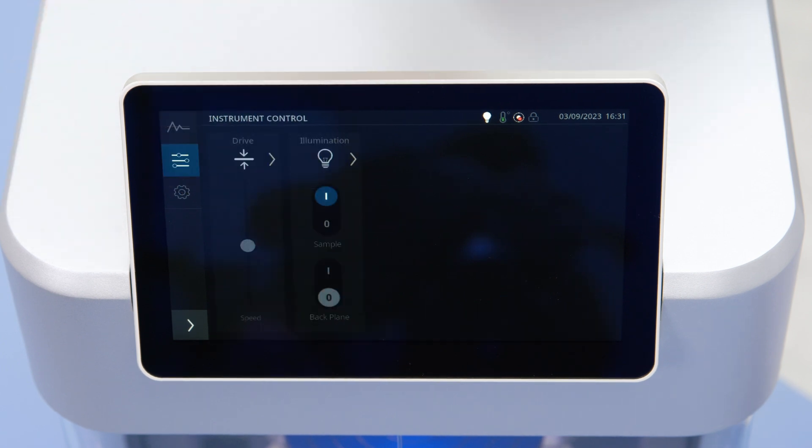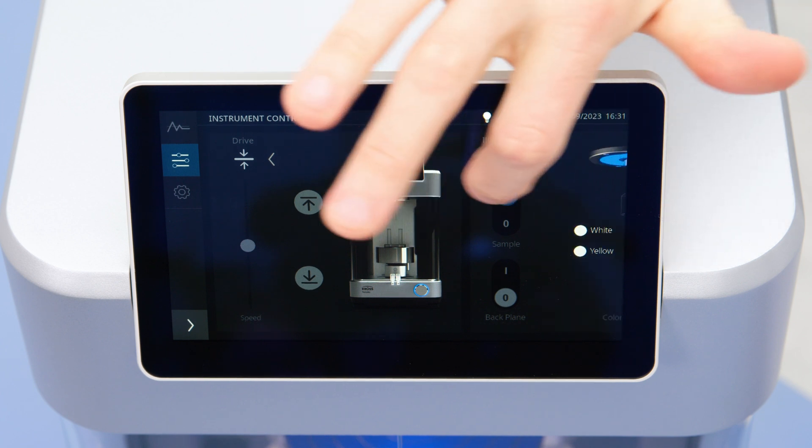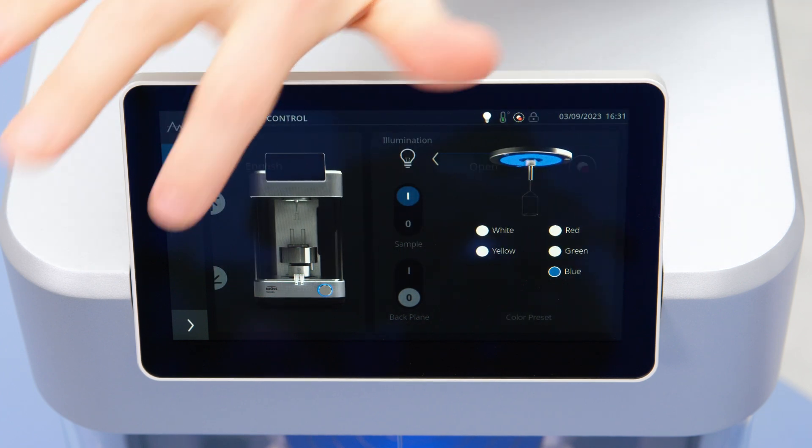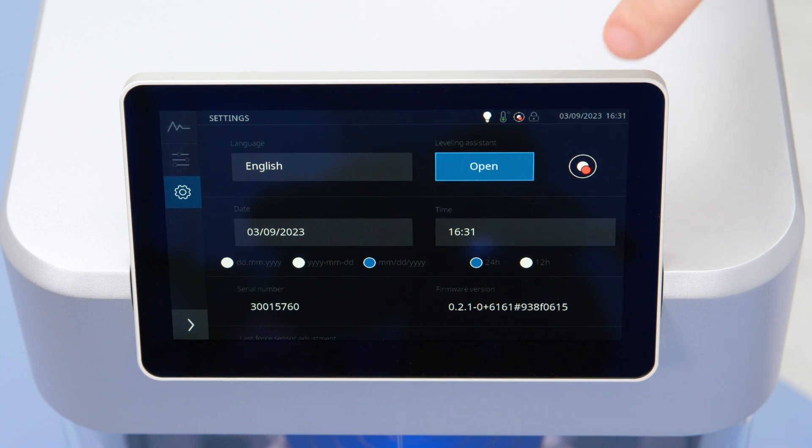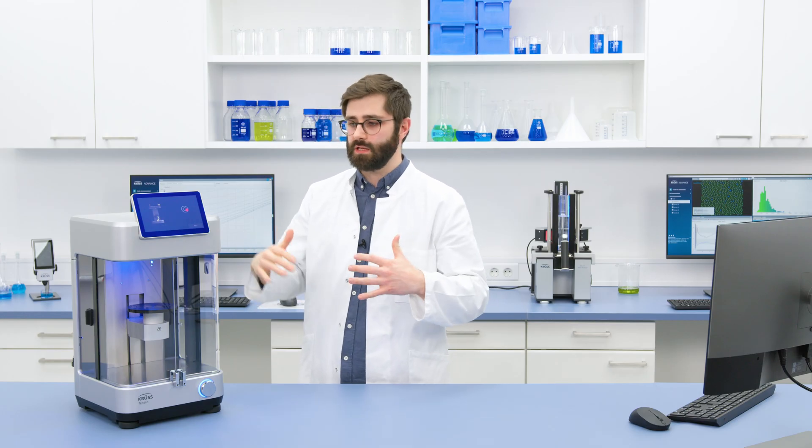If we look through some of the functions, you can see I can control the sample position, lighting of the instrument, or if we go into this setting here, Tensio has an inbuilt electronic bubble level that will tell you if the instrument is level or not.